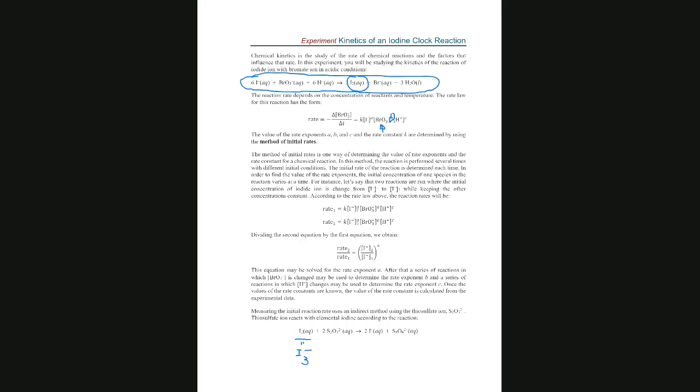So we are going to add everything. One student will add the last reagent, let's say bromate, and the other student will start the clock at 0. As soon as you see the blue, you stop the stopwatch and measure the time that the blue appears. Then we look at the change in concentration of the thiosulfate.